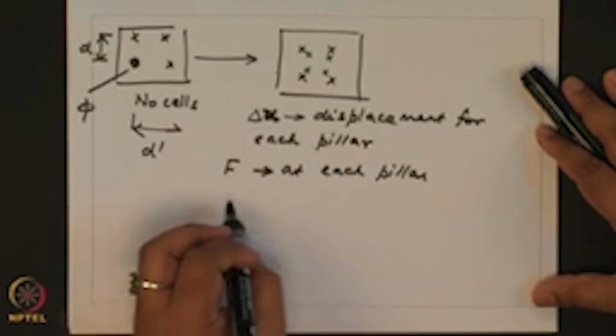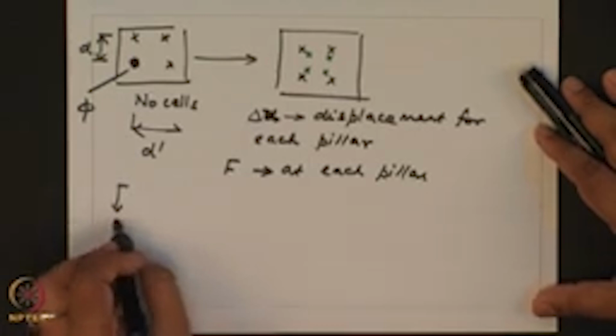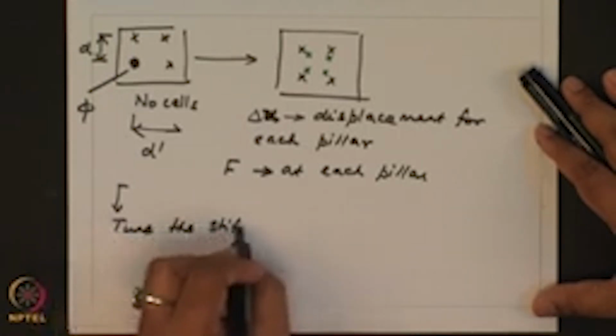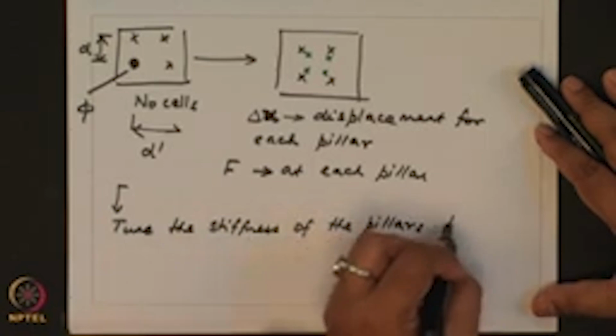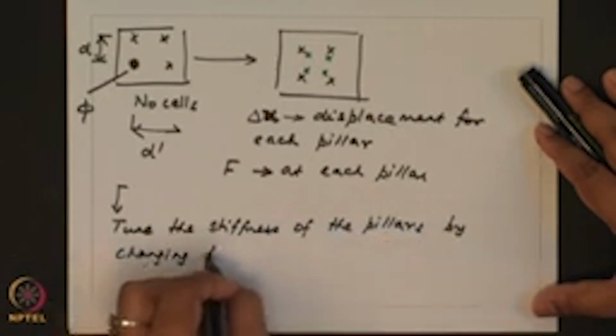So, the advantage of this technique is, first of all, you can tune the stiffness of the pillars by changing the pillar length.